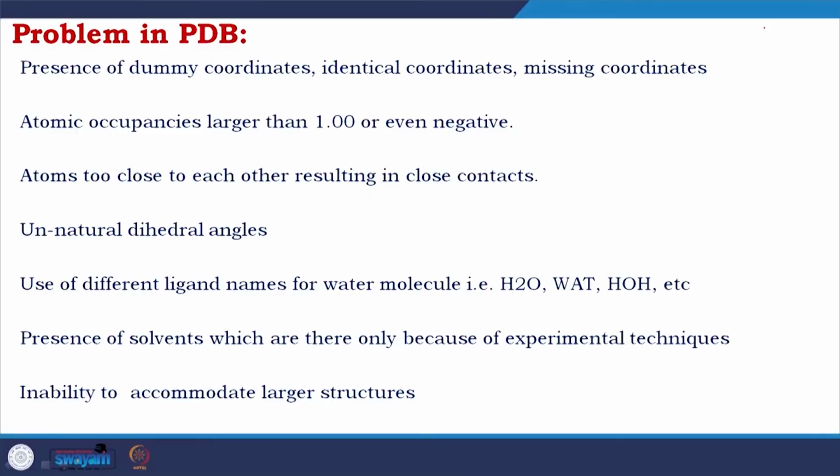Inability to accommodate larger structures with the current advent of cryo-electron microscopy. You have already seen huge structural assemblies are coming. The PDB format was created to accommodate crystal structures in the 1970s. Very few or no one imagined at that time that cryo-electron microscopy could solve such big assemblies.